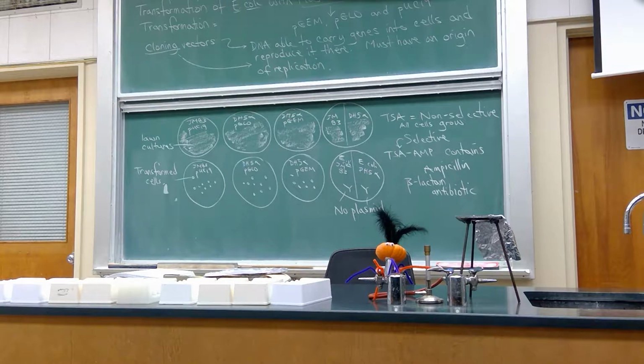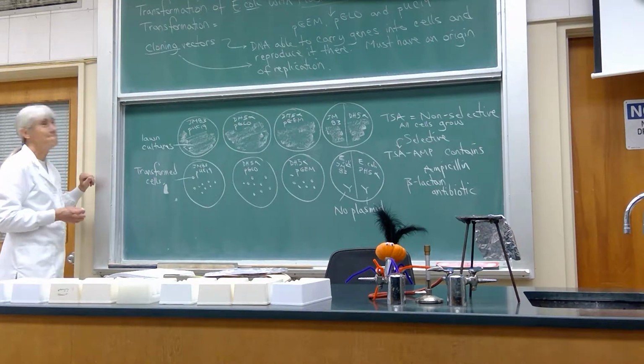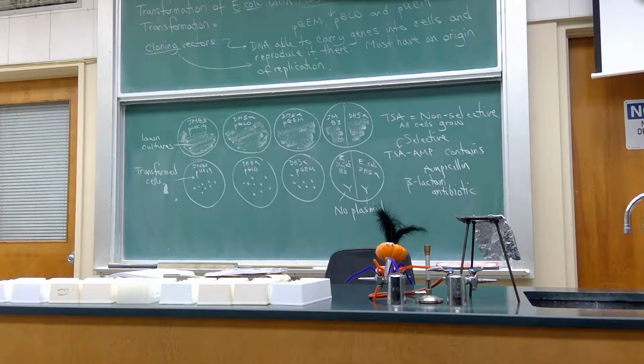Even under laboratory conditions where we made our competent cells up, we're really trying to improve the efficiency of transformation. Does anybody know what % efficiency you're likely to see in the lab manual? It's 10%. Under the best of circumstances, transformation efficiency is about 10%.